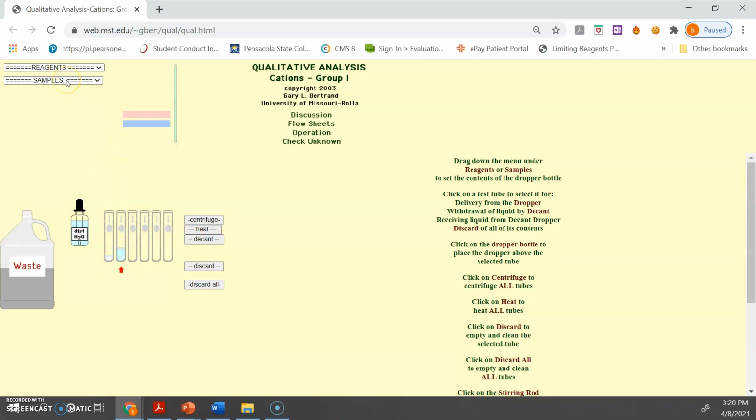And then you are going to add the sodium chromate. If this was the lead, you would see the sodium chromate giving you a yellow precipitate. Okay, yellow, so this confirms that there is lead in it.